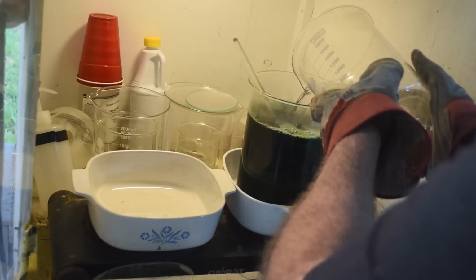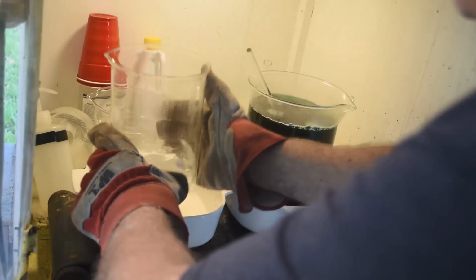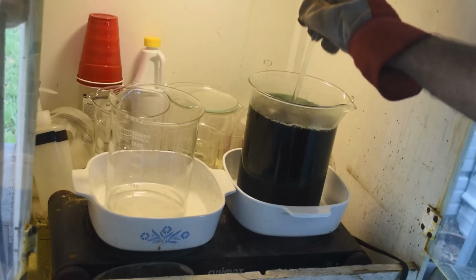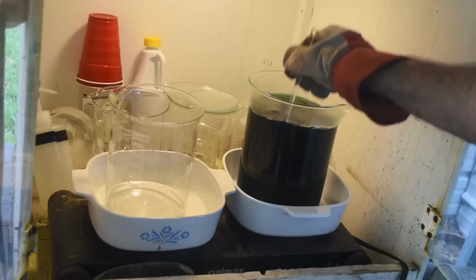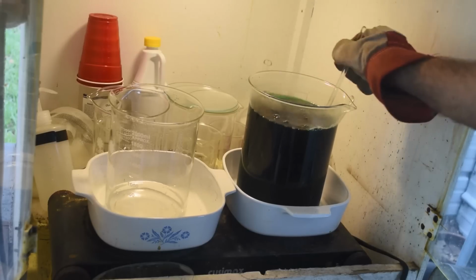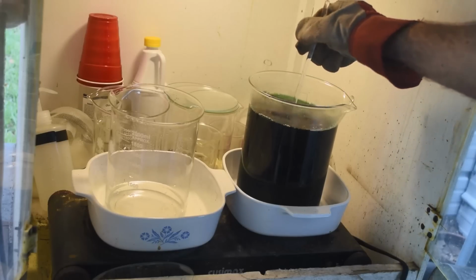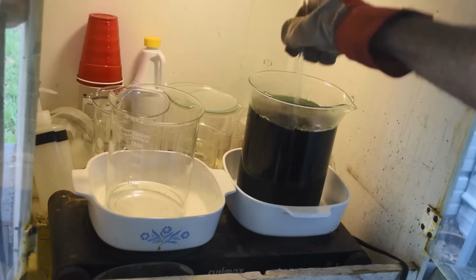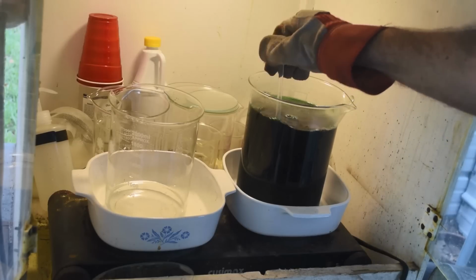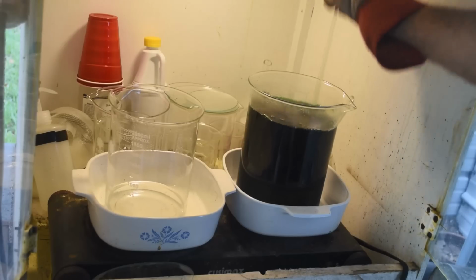Remember back in an earlier video, I actually broke a beaker. It might have been from continuing to heat it after the stuff on the bottom had gone solid. So we'll see what happens here. I'm hoping that this will soften up or dissolve these big lumps in here. We'll find out soon enough.